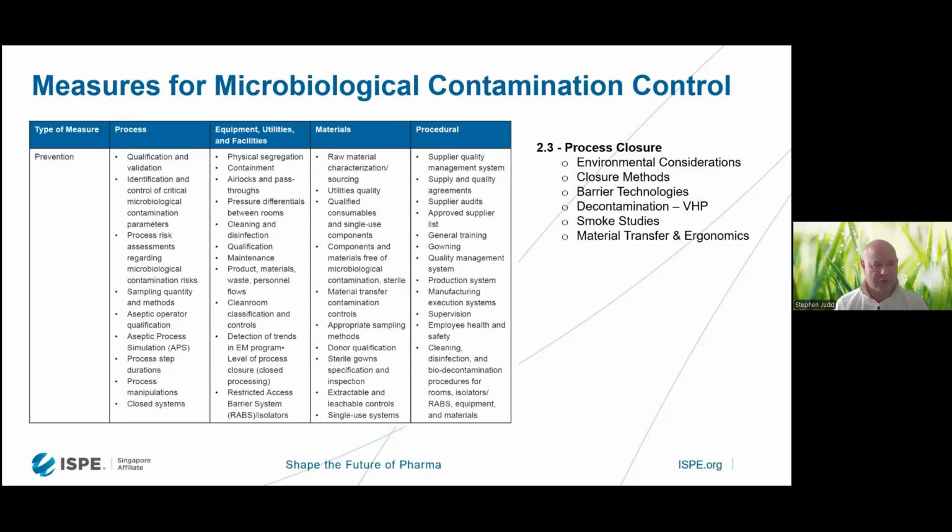Reducing the clean room grade means you have much less risk of an environmental incident taking the clean room down and interrupting production, which is more critical for cellular therapies, particularly autologous therapies, because you're dealing with material coming from a patient who is potentially waiting a prolonged period to be scheduled for their therapy.